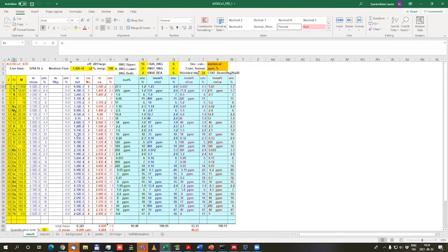And the program identified the possible elements. In this table, you see the results sorted based on the Z, so the atomic number. And here you see the measured masses. You can set uncertainties for the background components together with the uncertainties by adjusting these columns.